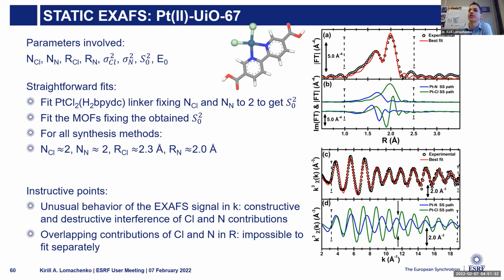It's actually not the worst case, because at least you see it. Sometimes the amplitude goes to 0, so you have basically a straight line, and then you start seeing the oscillations again at higher k after this straight line region.